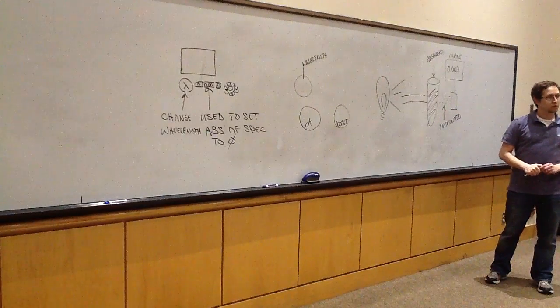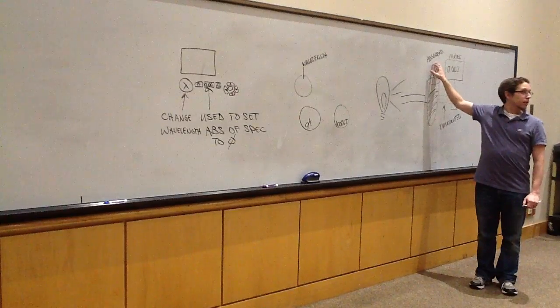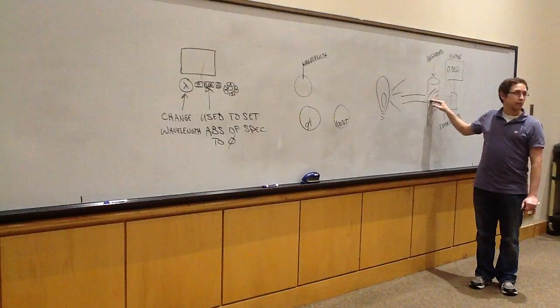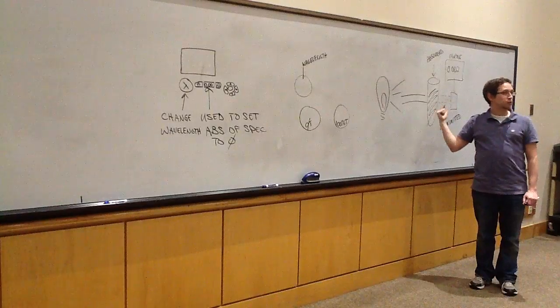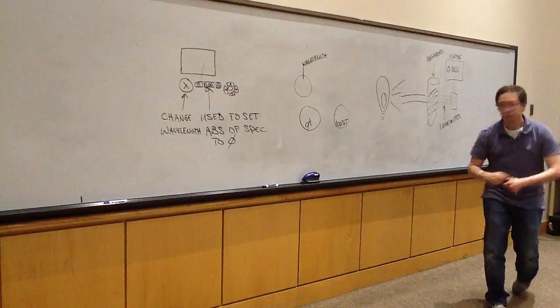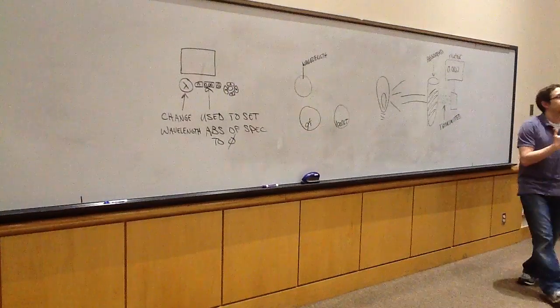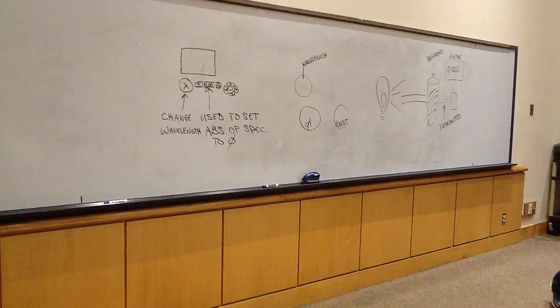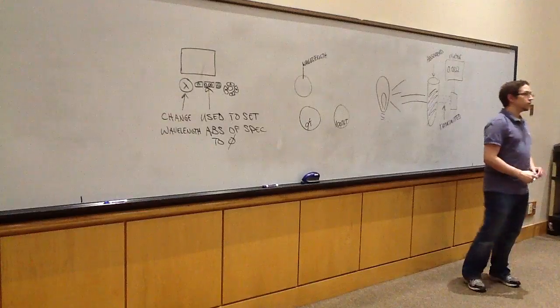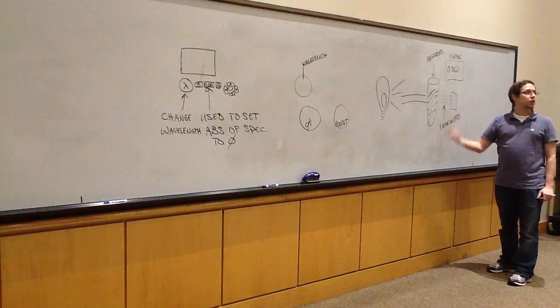Would you mind just rephrasing that one more time? Absolutely. So, light that is absorbed, when this light hits the sample, is light that does not pass through. Okay? So that light gets absorbed by the substance. Whatever light does pass through, we refer to that as the light that is transmitted by the sample. Okay. Right. So, this is the core concept.